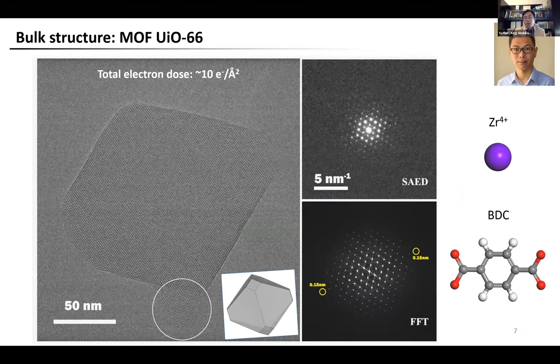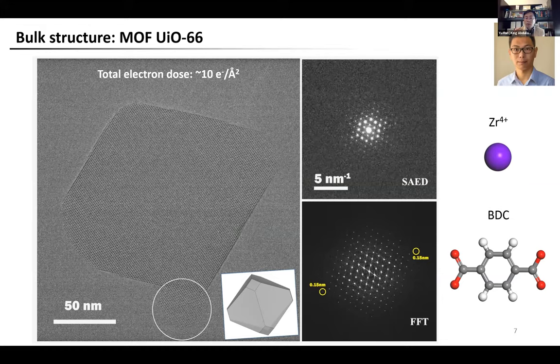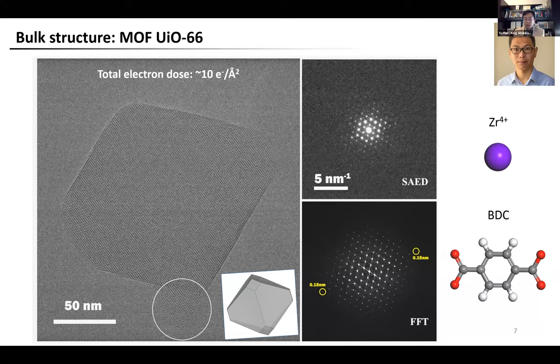Before studying local structures, we started with the bulk structures. Most MOFs have known crystal structures solved by X-ray diffraction, so imaging the bulk structure doesn't provide additional structure information. However, imaging the known bulk structure is necessary and very important because it can serve as a reference to confirm that the imaging conditions are safe enough to preserve the structure from damage. This ensures that any observed local structures are inherent, not induced by beam damage. It doesn't make sense to image local structures under conditions that damage the bulk structure.